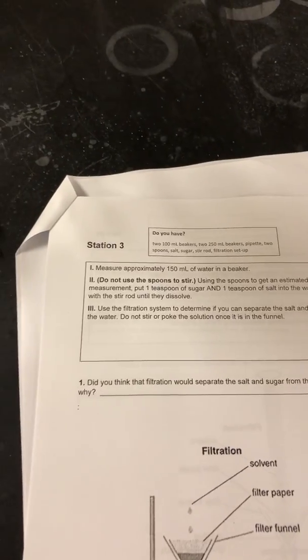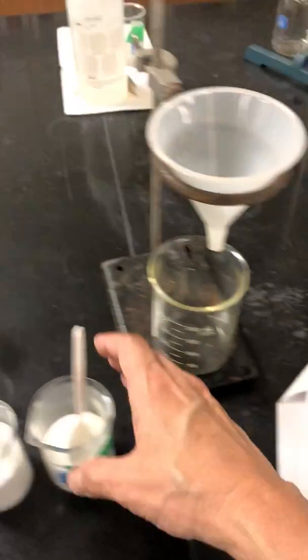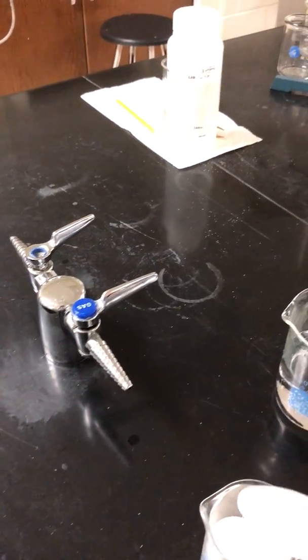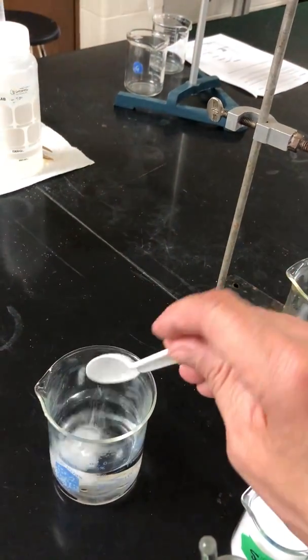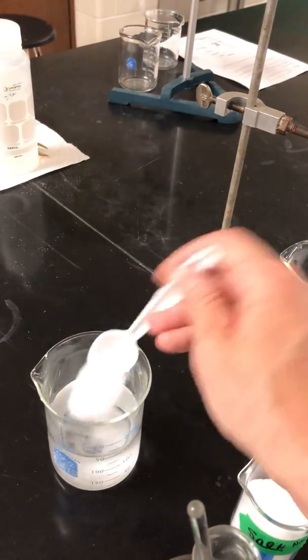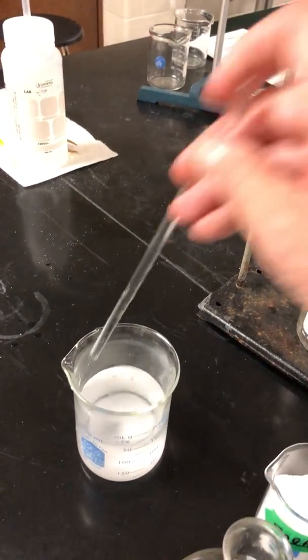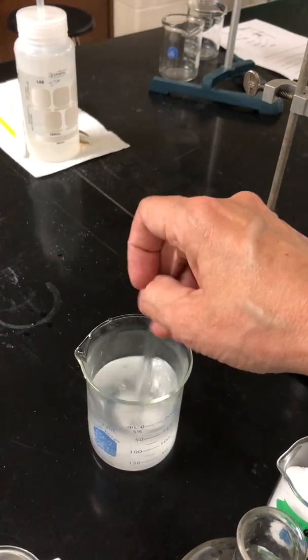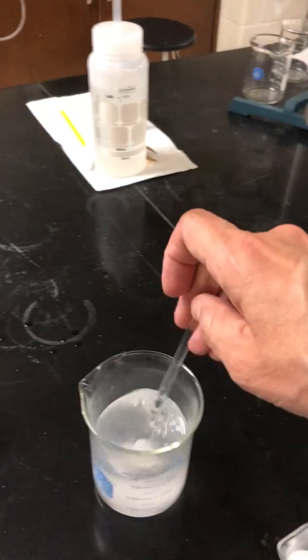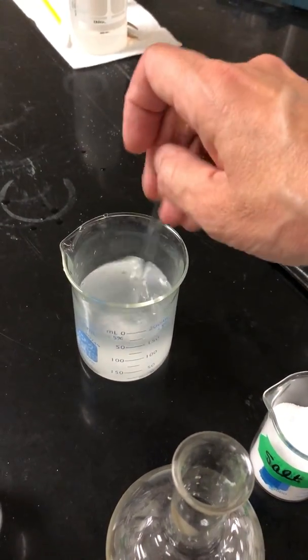Using the spoons, get an estimated measurement. Put 1 teaspoon of sugar and 1 teaspoon of salt into the water. Sugar and salt. Okay, it's an interesting mixture. Stir with the stir rod until they dissolve.